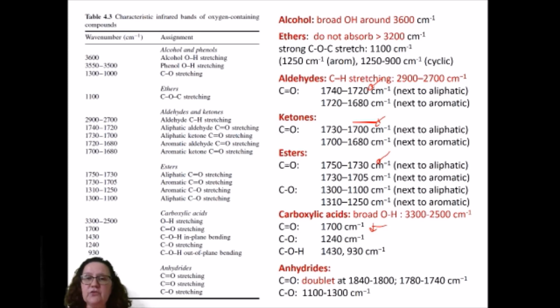Look for the presence of additional bands that you might be able to spot, like for example a broad band corresponding to a hydroxyl group combined with a carbonyl group, which is likely to indicate the presence of a carboxylic acid, rather than being too strict about where exactly that carbonyl group appears. These are just typical ranges. They do not reflect all the possible combinations. So use these tables as indicative of the position rather than a fixed rule.